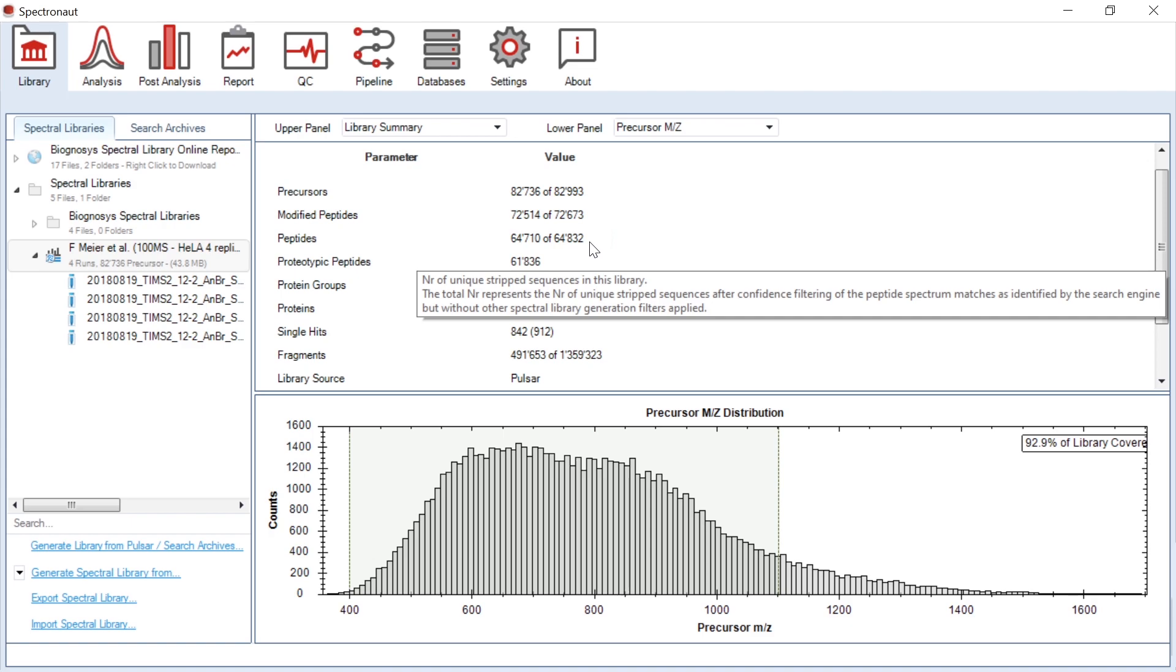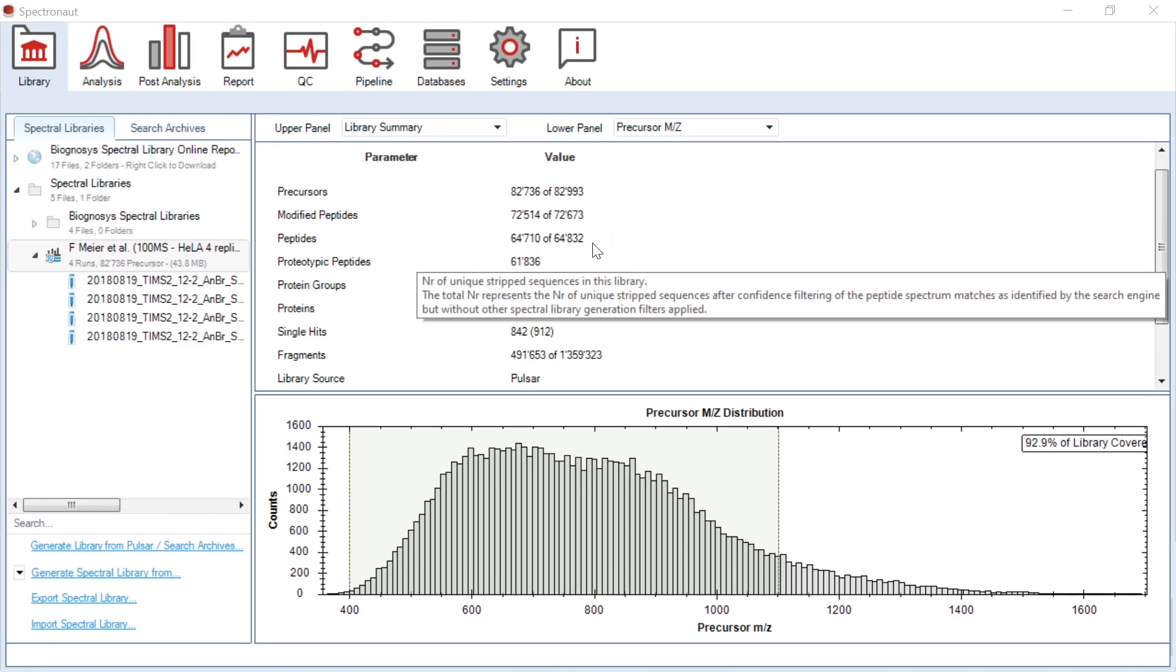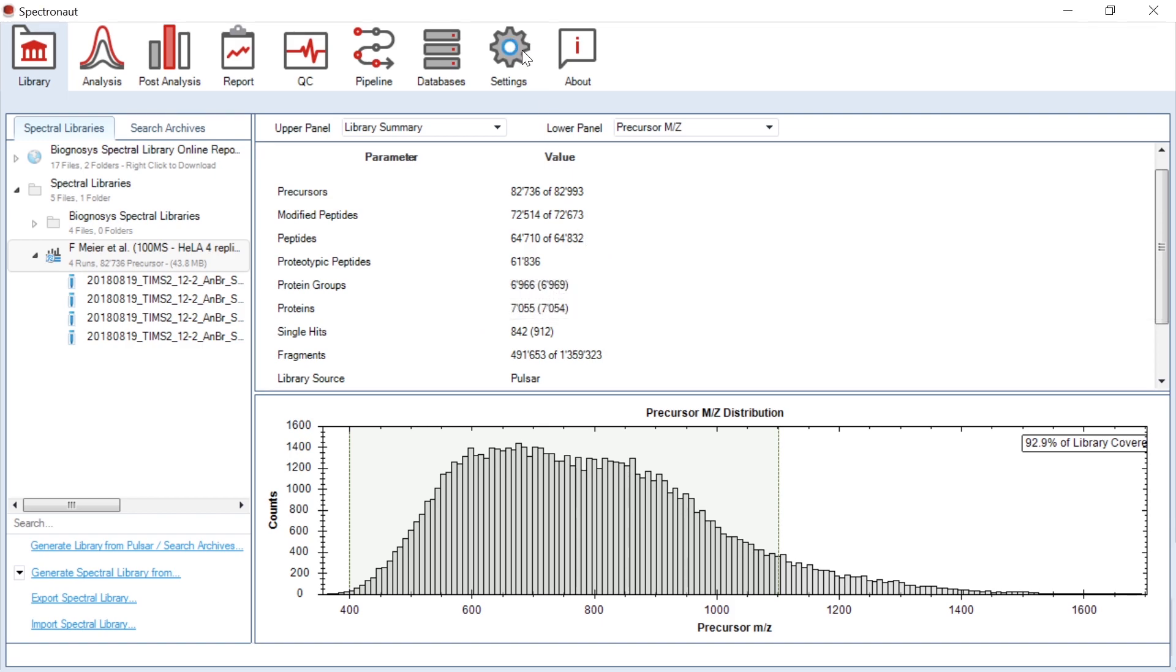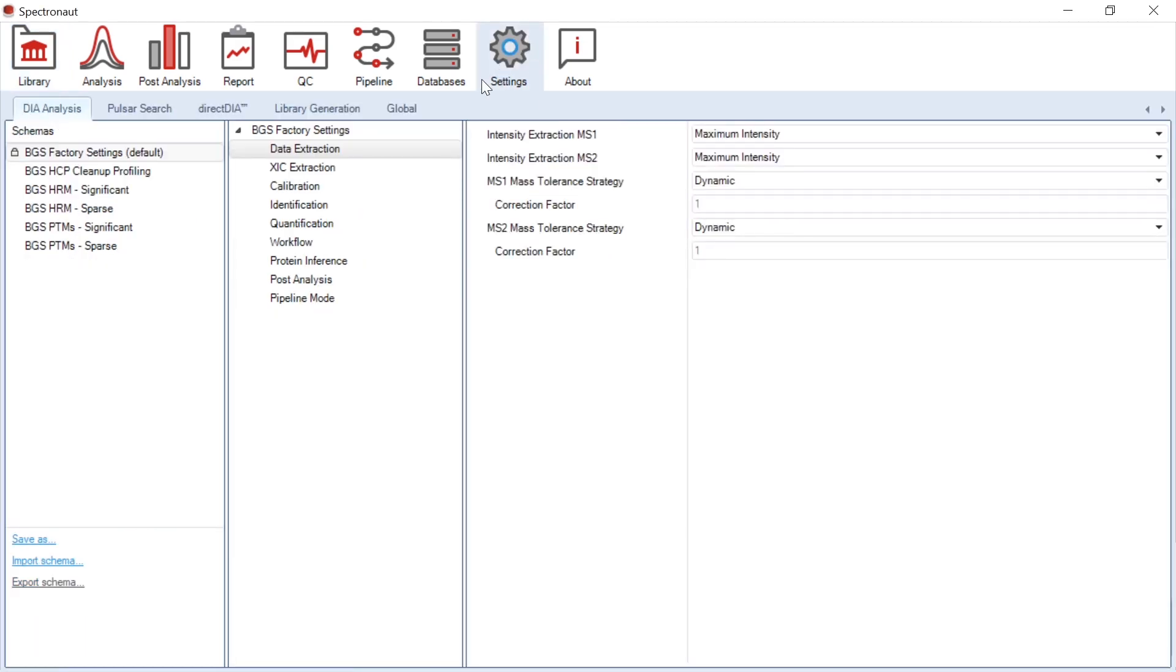As I previously mentioned, unique to Pulsar, it can also directly search dia-PASEF runs or HDMSE runs. Once you have generated an appropriate library, you can perform ion mobility-based DIA extraction. Generally, settings you would need to choose for this step do not differ from the settings you would choose for the experiment without ion mobility.